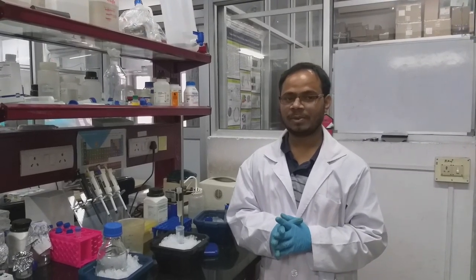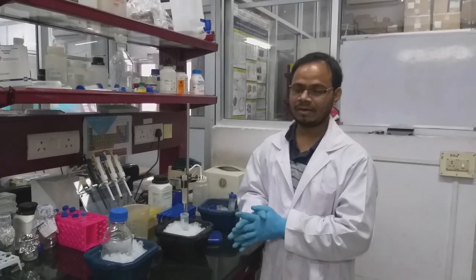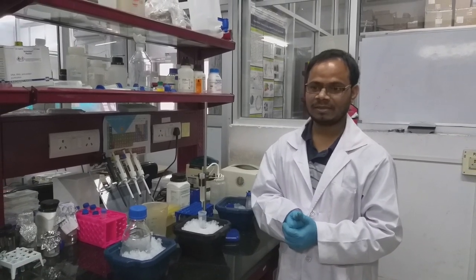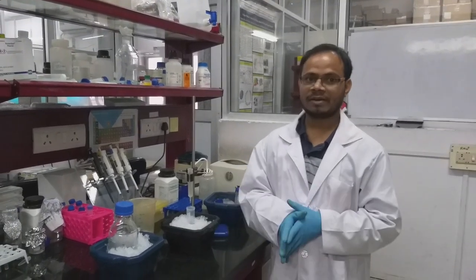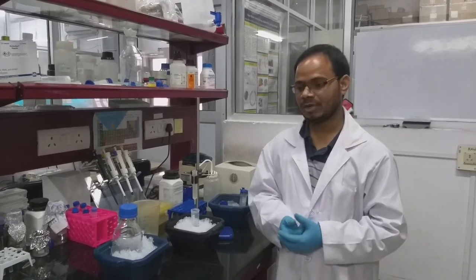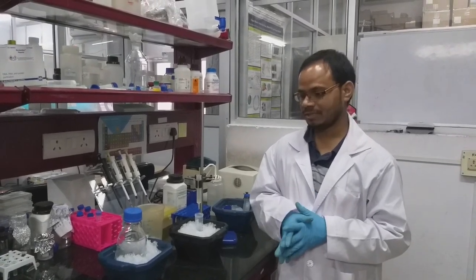For all these buffers, the pH should be adjusted beforehand. It's not like you first take the lysis buffer and then add imidazole, because it may change the pH of the buffer. So after combining the lysis buffer with the imidazole, then we have to adjust the pH so that throughout the procedure the pH won't change.